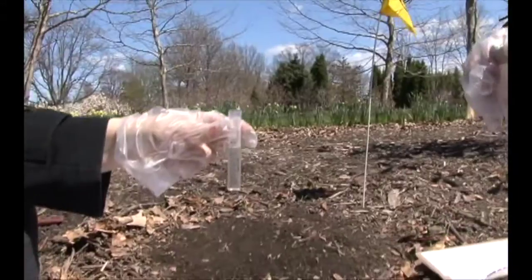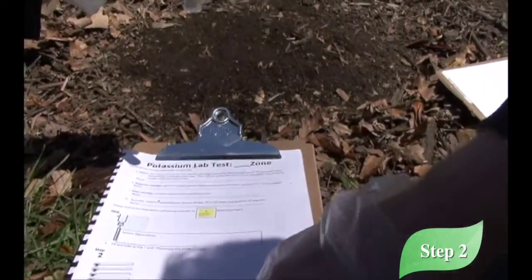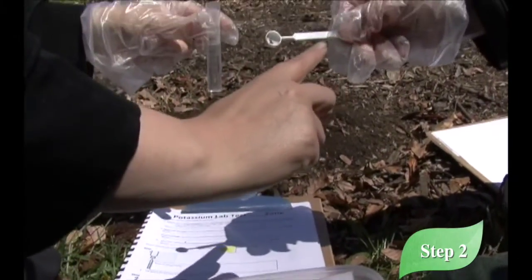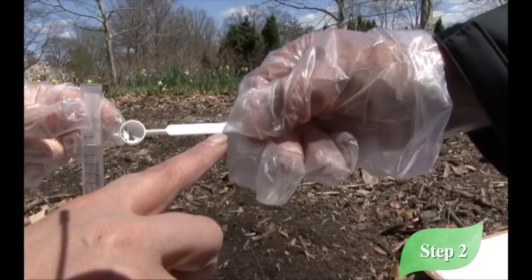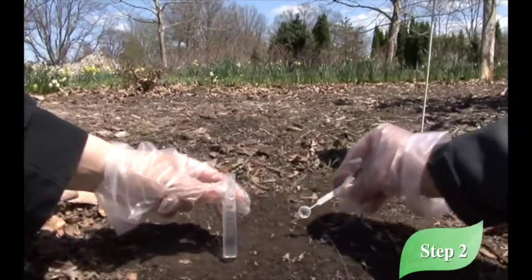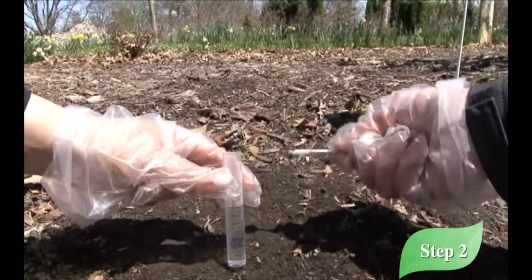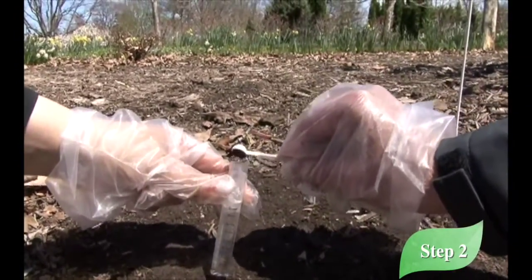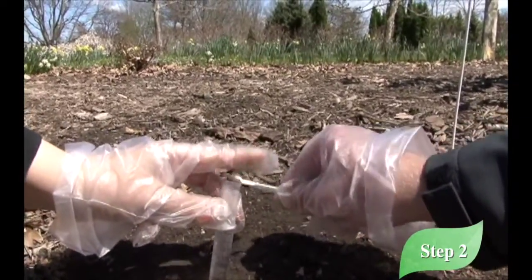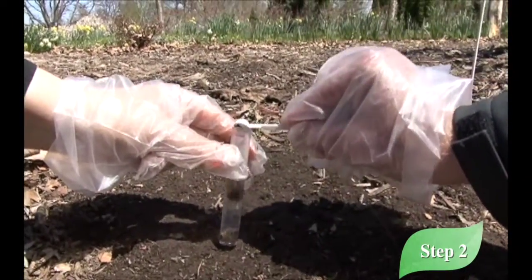Okay, step 2, we need to get 4 spoons of soil. So grab our spoon from our section and notice that it says 0.5 grams. That's exactly what we need. So 4 scoops. Let's grab 4 scoops of soil. Scooping the soil doesn't have to be perfect. If you have some that's overfill on the scoop, you can scrape it off with your other glove and just tap. Doesn't have to be perfect.